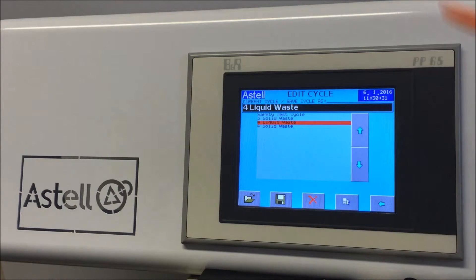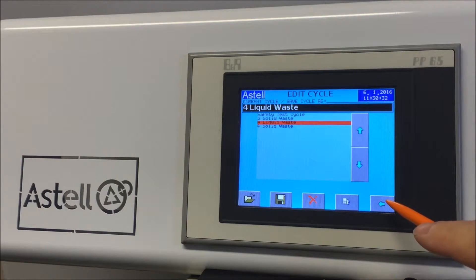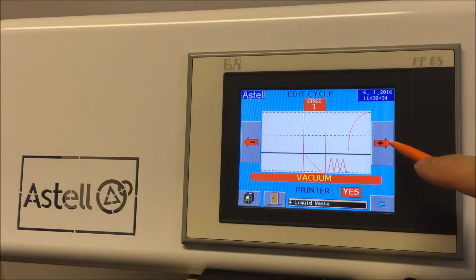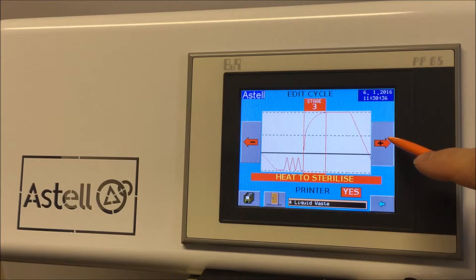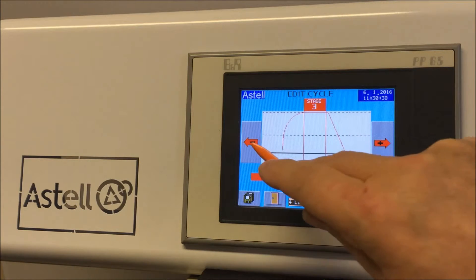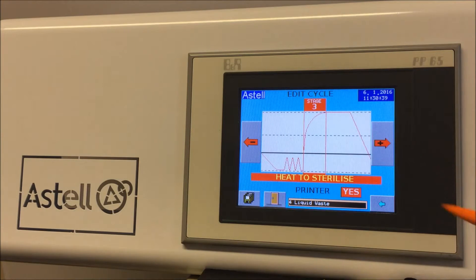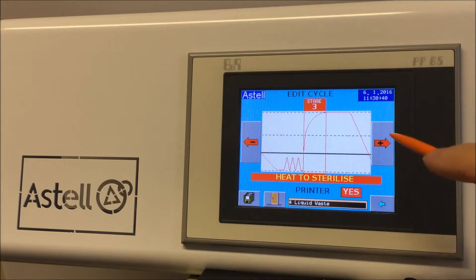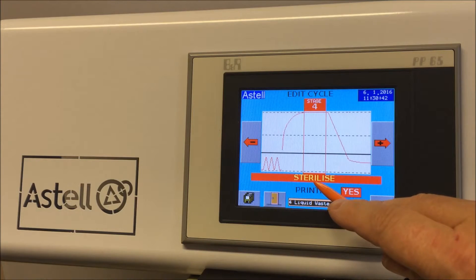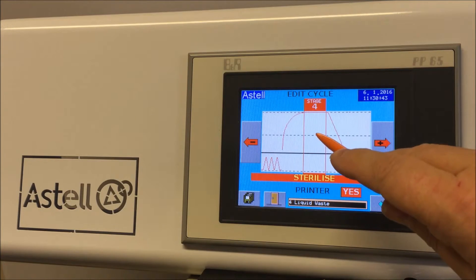Press the left arrow icon on the bottom right of the screen and the stages are now shown graphically. Use the left and right arrows to select the stage to edit. Move to stage 4, the sterilization stage.